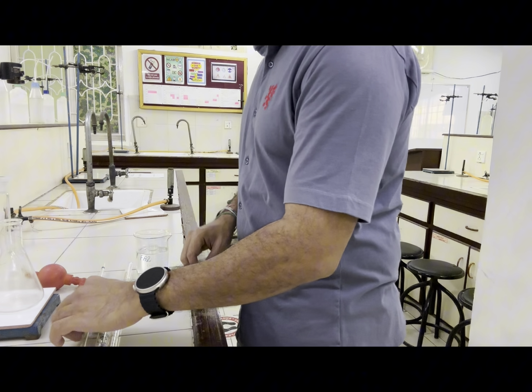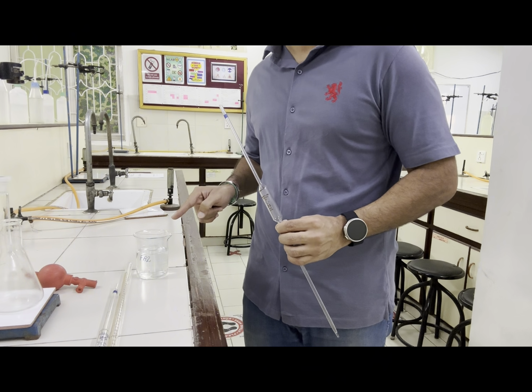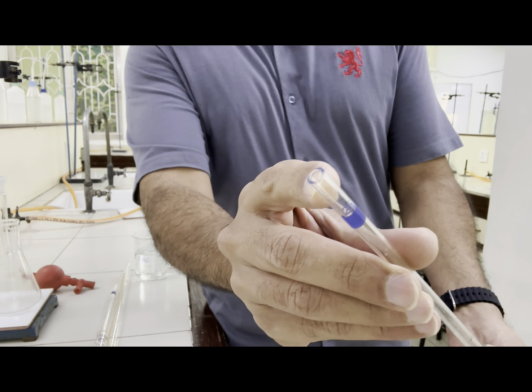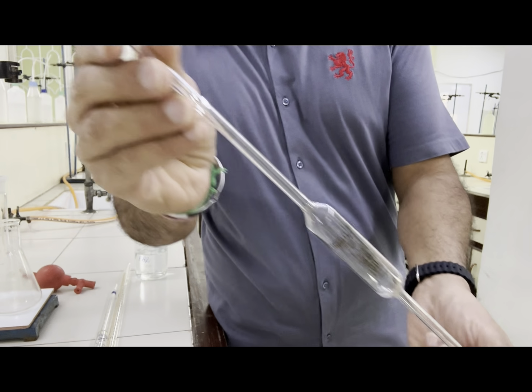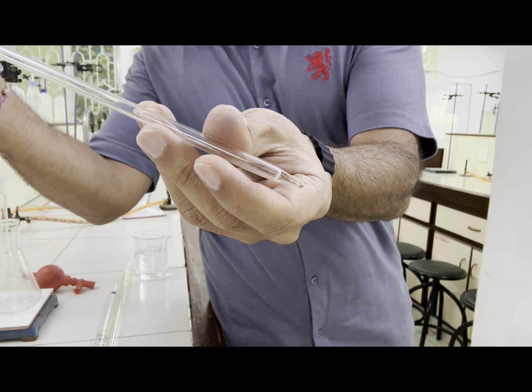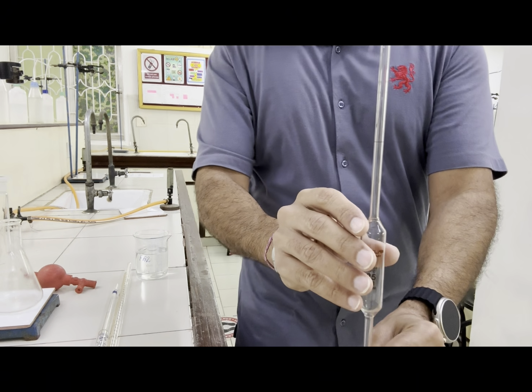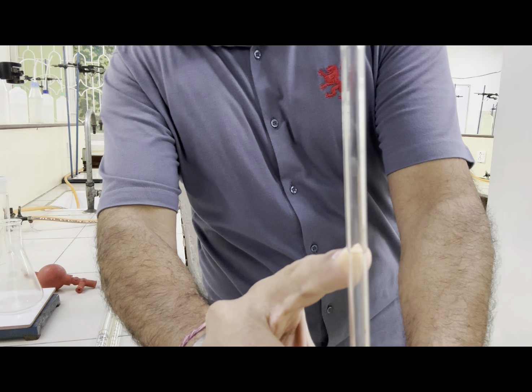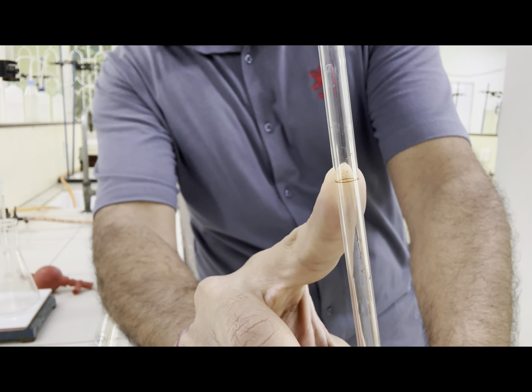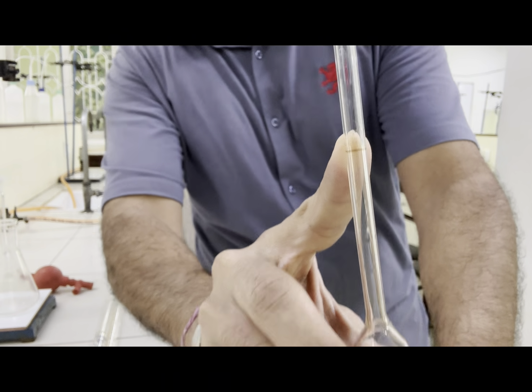Now using the pipette, let us take 25 centimeter cube of this Fa2. A pipette has 2 ends. One is the broader end and the other is the narrow end. So this narrow end is the lower side and this is the upper side. There is a mark here which says that you have to take up till this mark so that it will be 25 centimeter cube exactly.